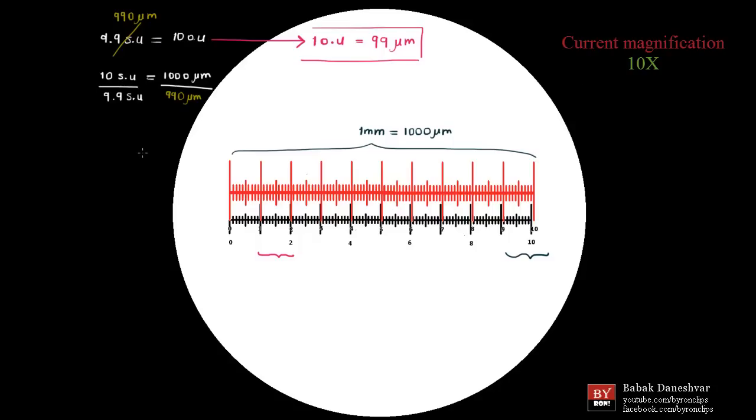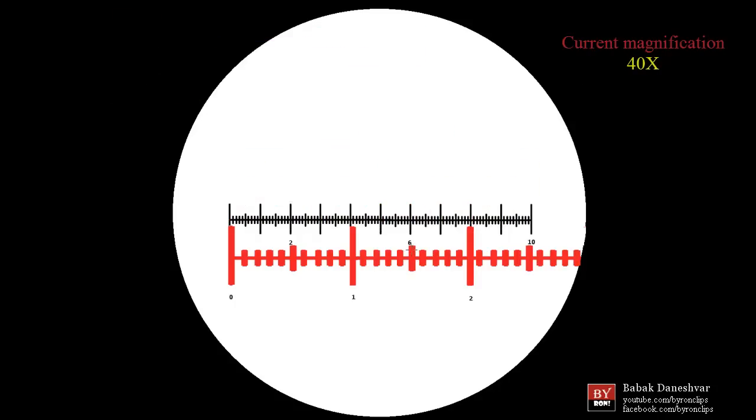Now let's move ahead and perform calibration under 40x magnification. You'll notice that under 40x, the entire length of the stage micrometer, down below this time, is not visible to us. We can only see around three stage units in our field of view this time. The rest of it being down here somewhere, which, by the way, is completely fine.